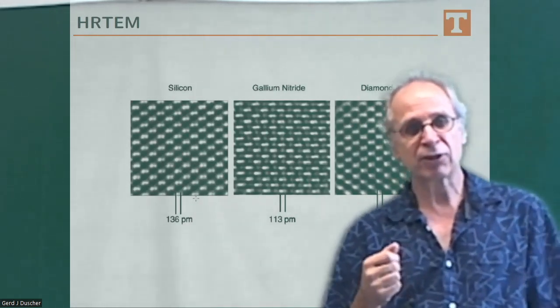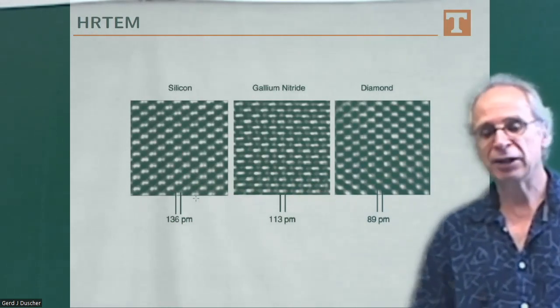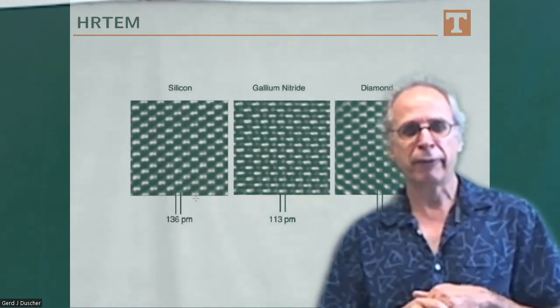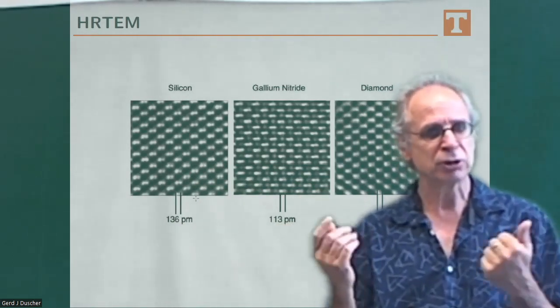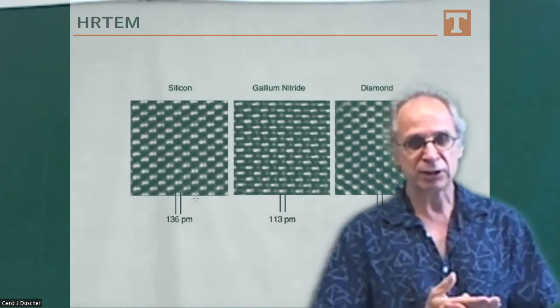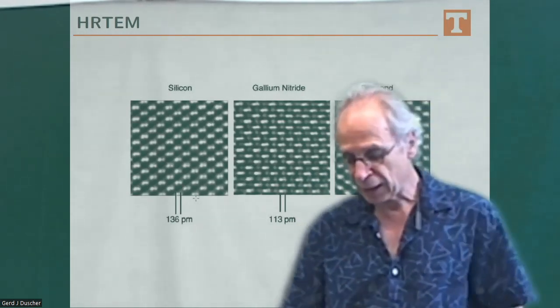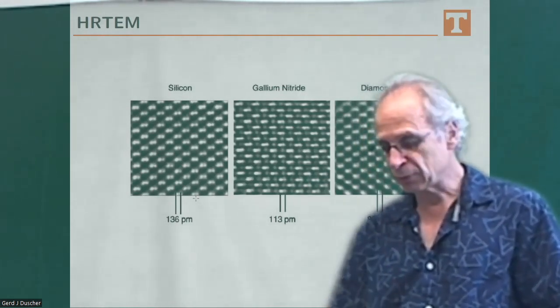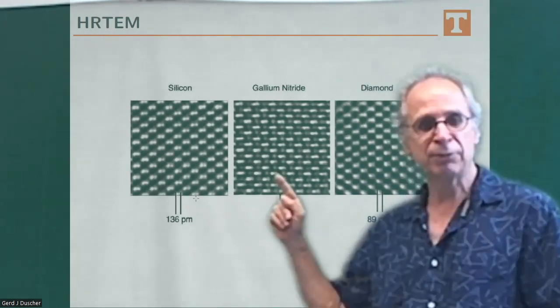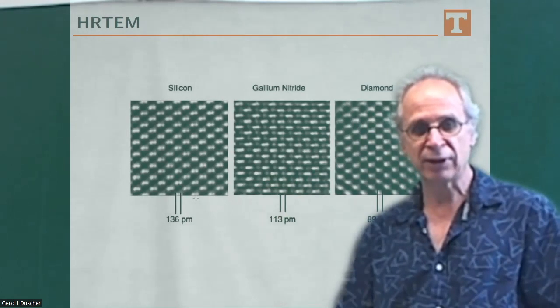If we look at these phase contrast images, we get resolution. The question is, can you trust that? So that's what we want to explore. And if you're a seasoned electron microscopist, then they will ask you, what was the defocus? What kind of microscope did you use? It could be the bright ones that are the atoms. It could be the dark ones. We don't know. That is the beauty of the phase contrast images. And that is the beauty of using other techniques together with phase contrast imaging, because that way you can unambiguously determine where the atoms are and what contrast mechanism you have. Please note here in gallium nitride, we have a few intensities in between what we would perceive naively as atoms, so the bright dots.